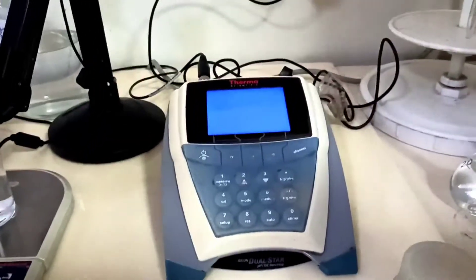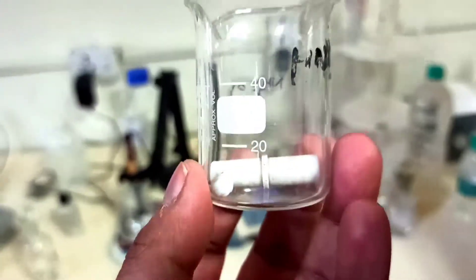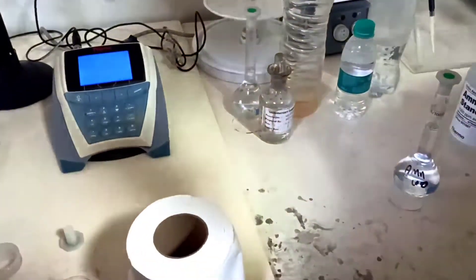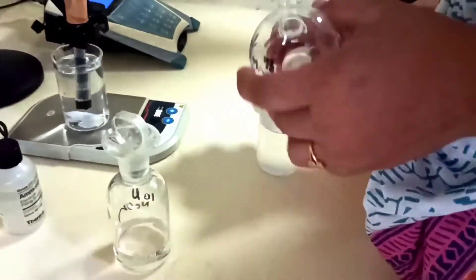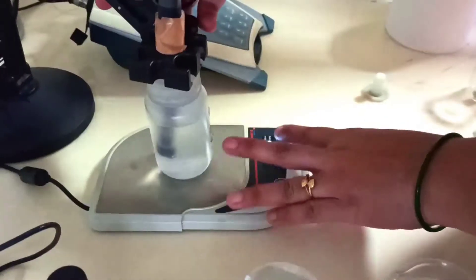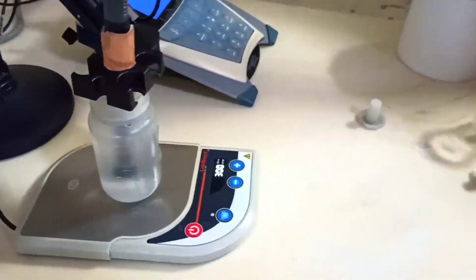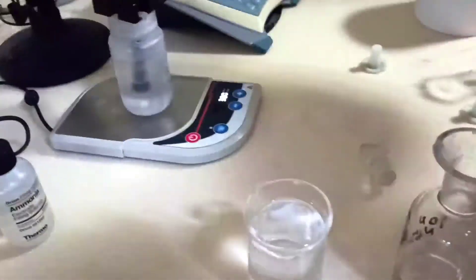We are using such type of magnets for magnetic stirring. Now we are ready for the second standard. We take our second standard, 10 ppm, and we add 1 ml buffer solution. Our buffer solution is 10 normal NaOH.